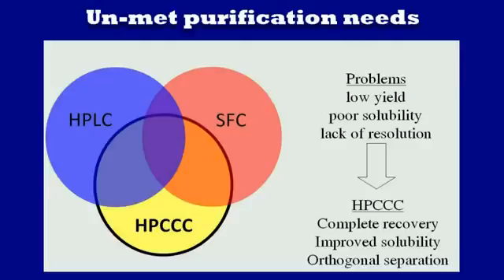Why is another liquid chromatography technique required? There are still issues that limit the effective use of liquid chromatography. These issues relate to low yields post-purification, sample solubility limitations, and insufficient sample loading capability. All these problems lead to the perception that liquid chromatography is expensive. Liquid-liquid chromatography can help resolve these challenges either as a standalone technique or in combination with HPLC or SFC.